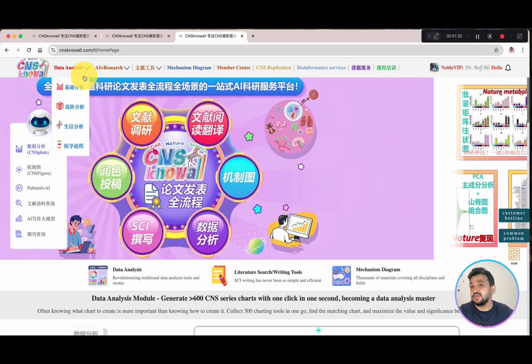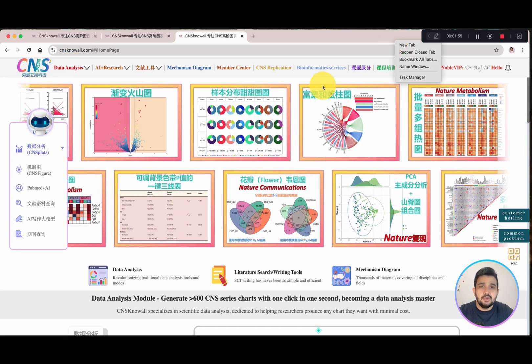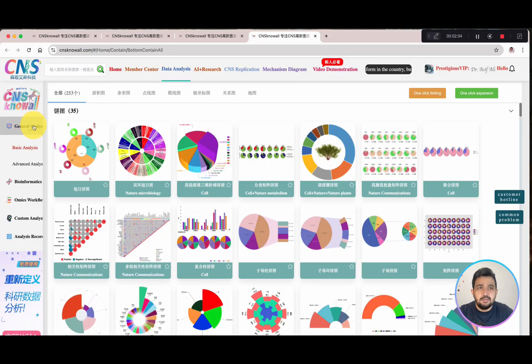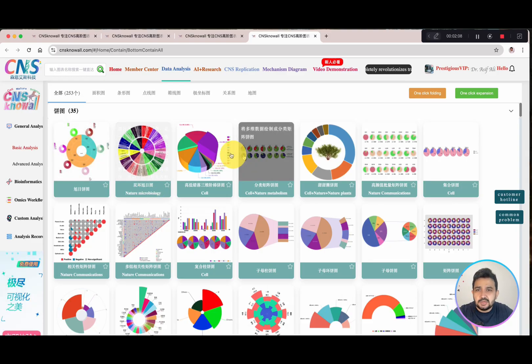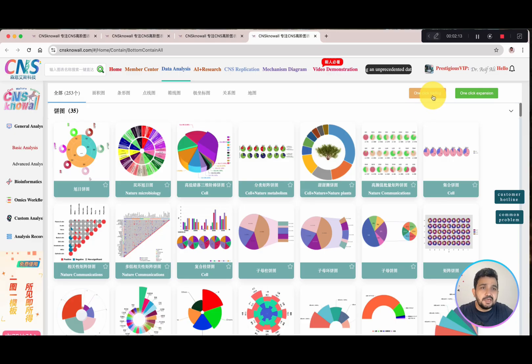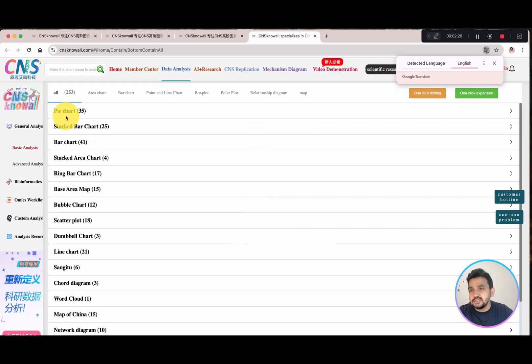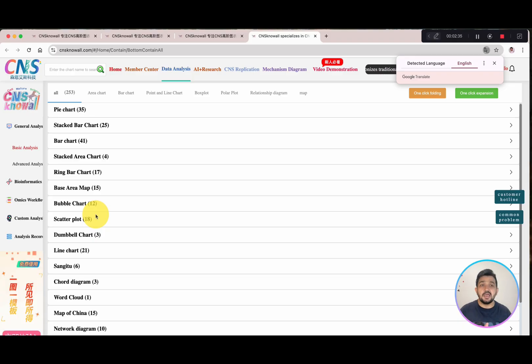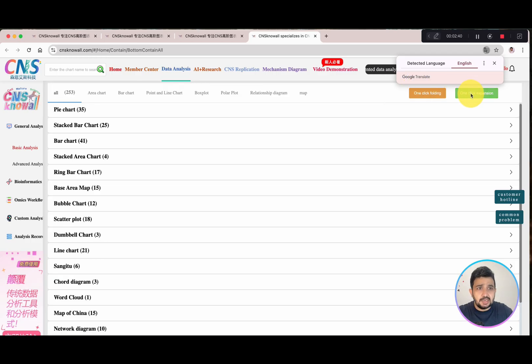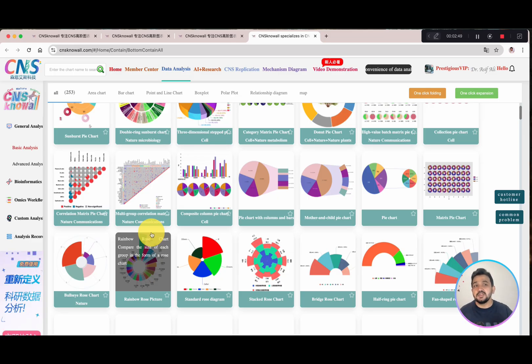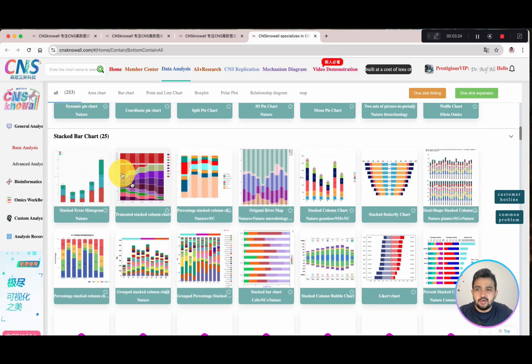Now let me give you a visit of all the different tabs. As you know, this is in Chinese, so we can simply translate it if required. We will click on the data analysis tab. Here you can see the different categories of graphs. You can use one-click folding and one-click expansion to organize them. Translating to English, we have pie charts, stacked bar charts, bar charts, stacked area charts, and bubble charts — similar to what we have seen in SR Plot and other web-based data tools.